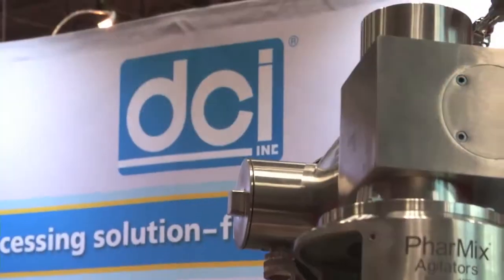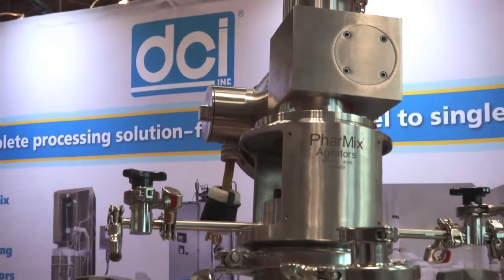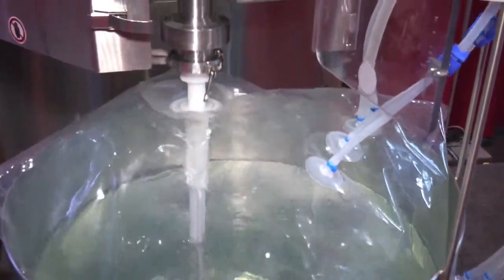DCI has been engineering and manufacturing agitation since 1955 and with this experience we have introduced our own line of agitation to include the PharMix family of standalone top-entering mixers and the PharMix SC system, which is a single-use mixing unit.